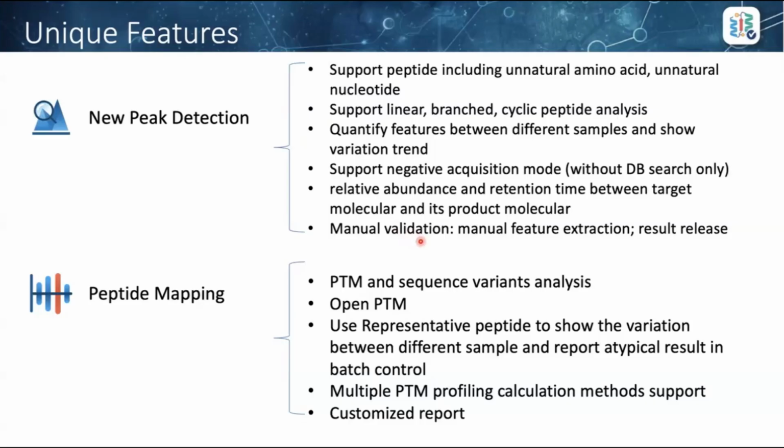In this function, we have more manual validation functions, such as manual feature editing, or manual feature extraction, and for the result release.